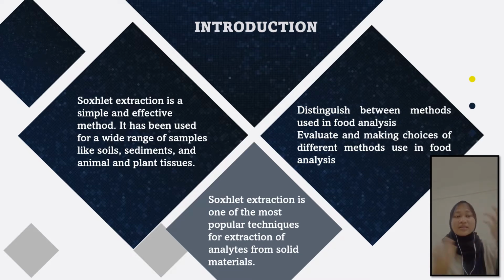This is mainly because it is simple to use and is the officially recognized method for a wide range of fat content determinations. Nowadays, improved extraction techniques tend to be more accurate and more generally applicable, and can therefore often replace the old standard method for the official analysis of many food materials. At the end of extraction, the solvent is removed in a step-by-step process, leaving the cups with only extractable matters of fat. The cups are dried and weighed, and the percentage of extractable fats is calculated.